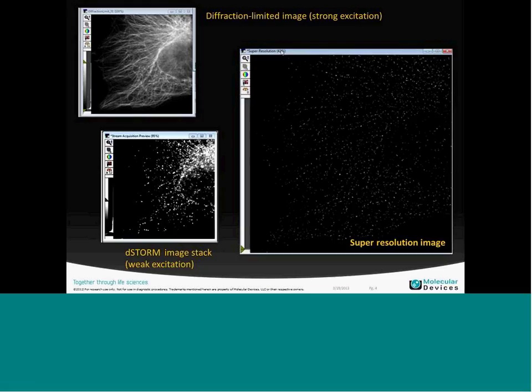Before our guest speaker, let me offer a few remarks on super resolution. Over the many years I have been involved with microscope-related research, the basic tenet of light microscopy has always been the discovery of Ernst Abbe that spatial resolution is diffraction limited to a value of about 250 nanometers. Today's talk on super resolution concerns ways of bypassing this limitation and methods of achieving an approximately 10 times better result while still using light microscopy. Methods such as STORM, PALM, and dSTORM are genius and deceptively simple conceptually.